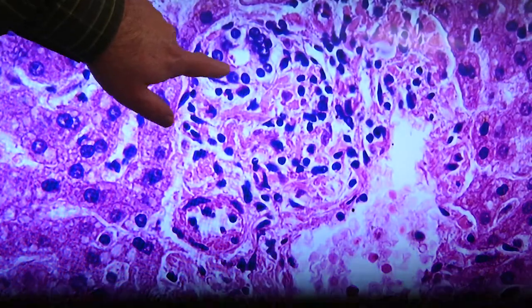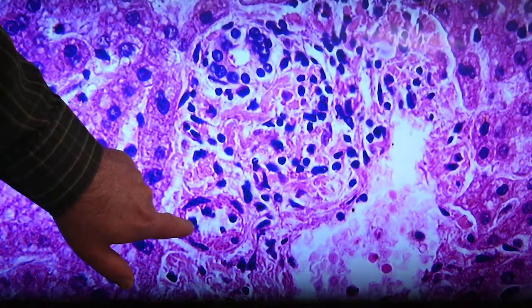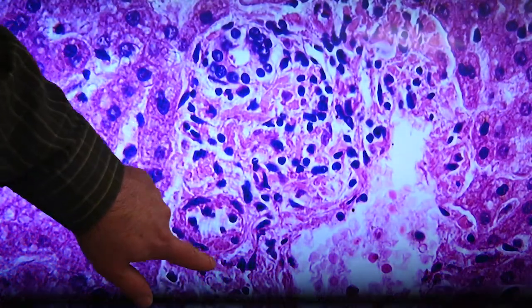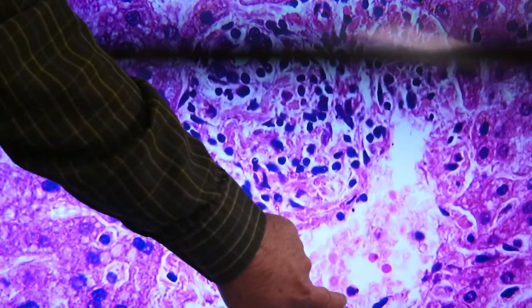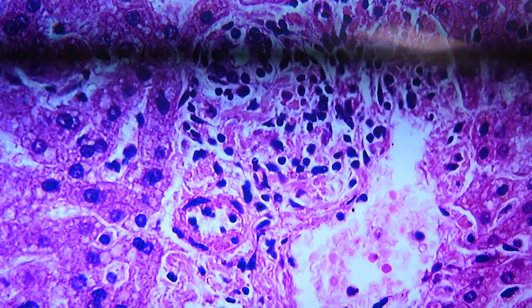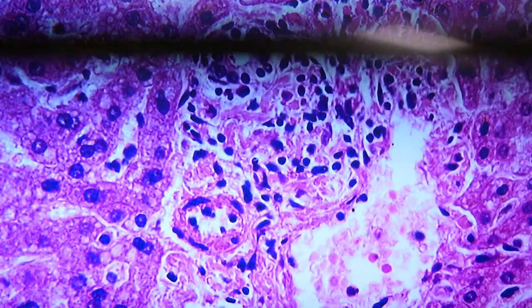Here we have a ring of cuboidal cells making up the duct. Down here we have an artery branch, a branch of the hepatic artery. The nuclei of endothelial cells are pushed to the middle toward the lumen there, and then we have some smooth muscle nuclei surrounding that. Over here, this larger space, these are all red blood cells. A few other cell types and white blood cell types in there, but anyway, this large space is the hepatic portal vein branch. So everything around the artery, bile duct, and portal vein in here, these are all connective tissues associated with the portal triad.